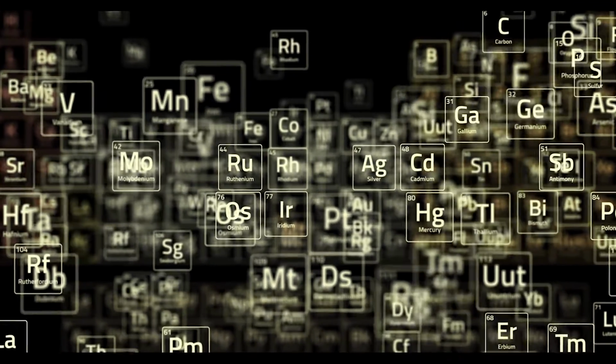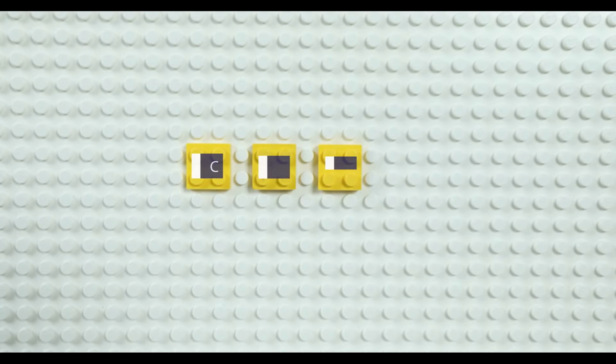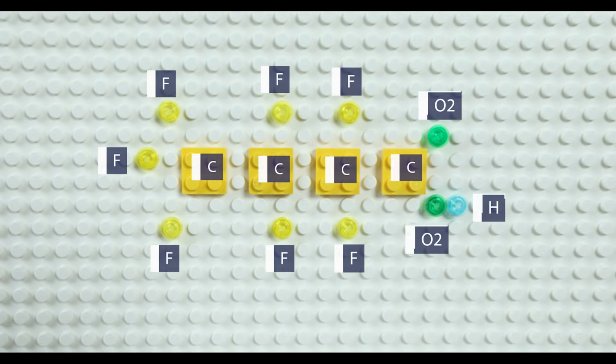The thing that all molecules have in common is they all have mass. Each unique molecule has a distinct mass. All organic molecules, including PFAS, are made of carbon. Each carbon has a mass of exactly 12. As we start to add things like fluorines and hydrogens, we start to build out molecules such as PFAS. Once we've built that molecule with a unique number of carbons and a unique number of fluorines and hydrogens, we have a unique mass for that PFAS molecule.